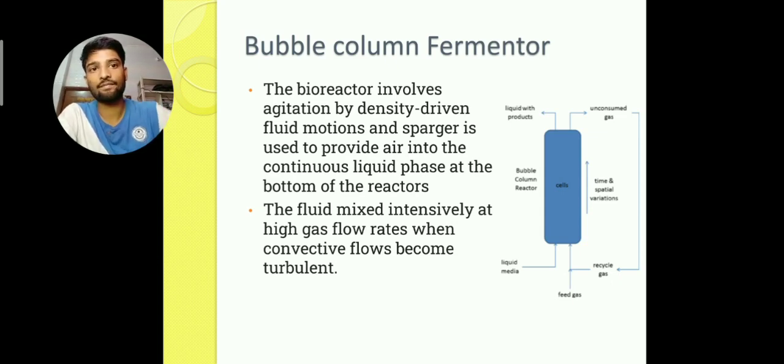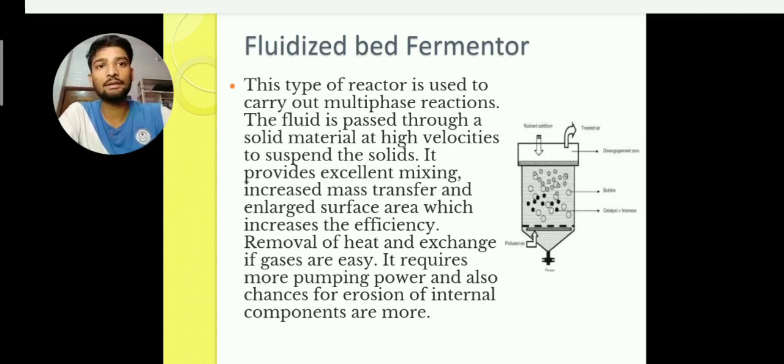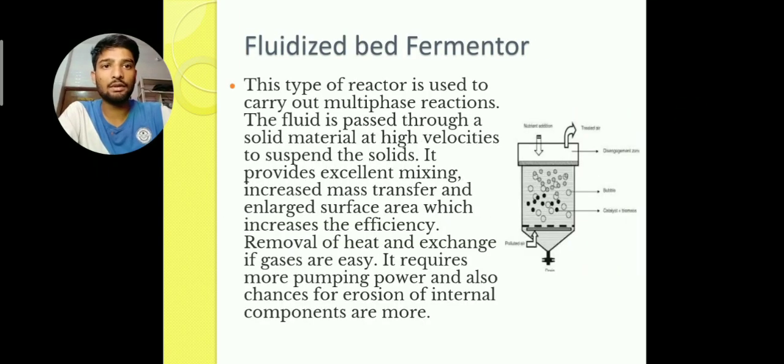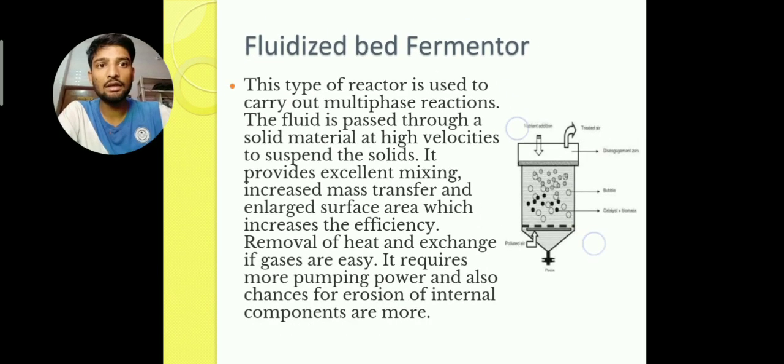Now we will discuss the third type, the fluidized bed fermenter. It is almost the same as the bubble column fermenter, but in this the upper part is a lot wider.